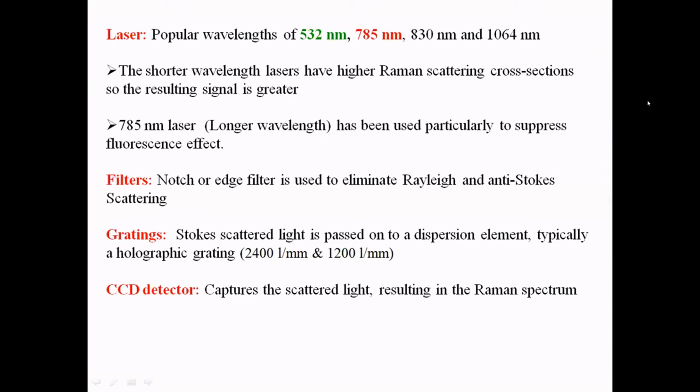If you have a substance, a material or a powder whose functionality or structure has a strong fluorescence effect, that means when the photon is interacting with the material, it may undergo an emission process, because the functional group already absorbs some portion of the light, and later it slowly releases secondary emissions starting from the functional group.